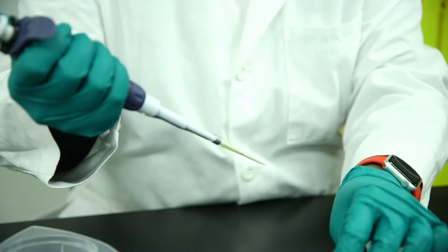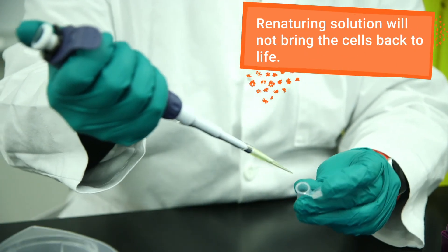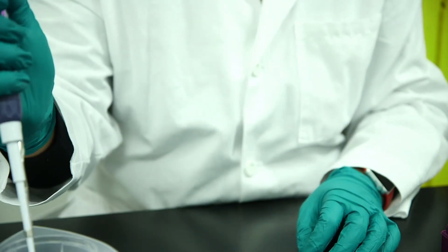Next, add the renaturing solution. This lowers the pH back down, which causes the proteins and genomic DNA to precipitate and leaves the smaller plasmid DNA in suspension.